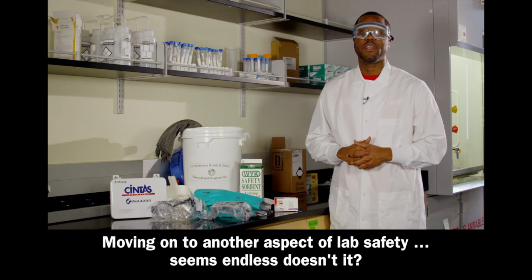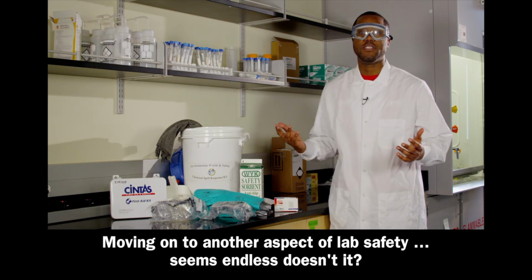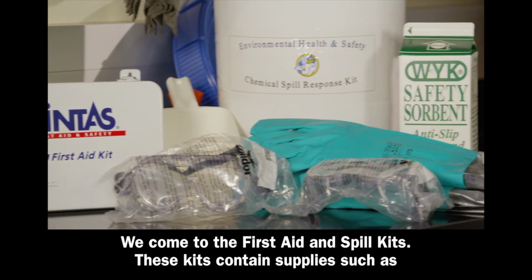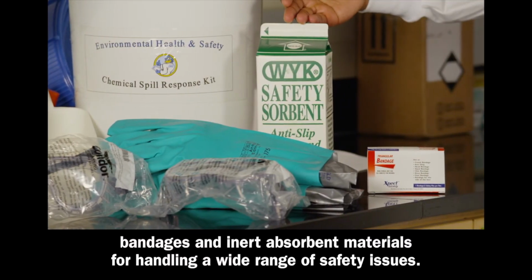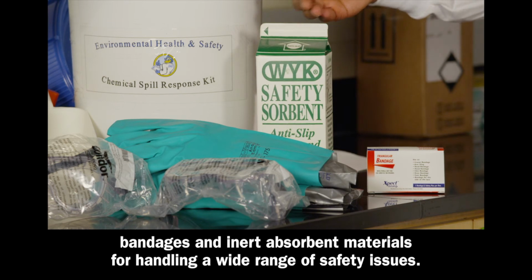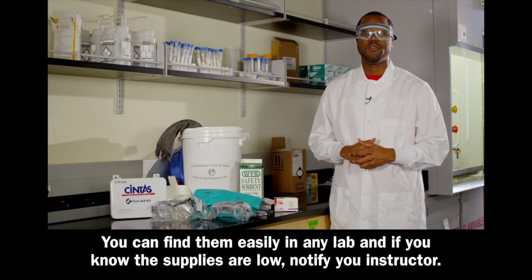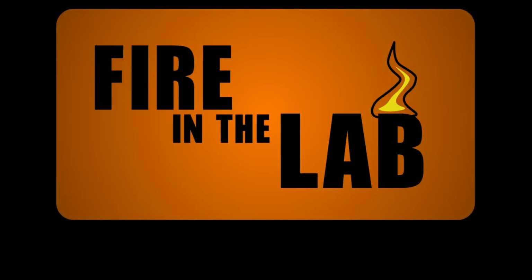Moving on to another aspect of lab safety. Seems endless, doesn't it? We come to the first aid and spill kits. These kits contain supplies such as bandages and inert absorbent materials for handling a wide range of safety issues. You can find them easily in any lab, and if you know the supplies are low, notify your instructor.